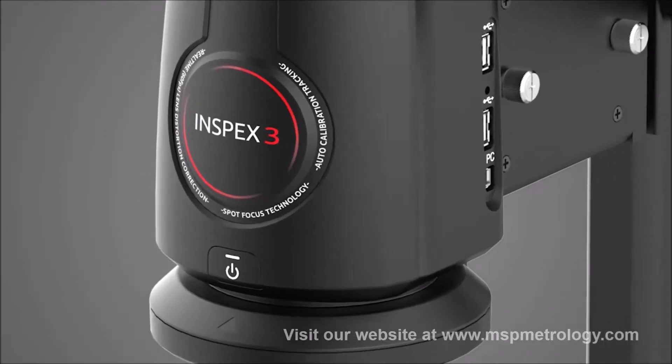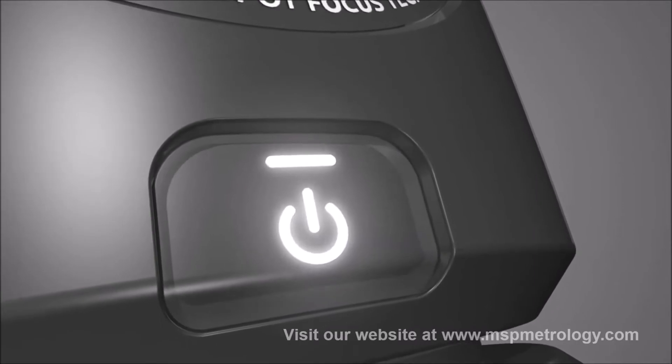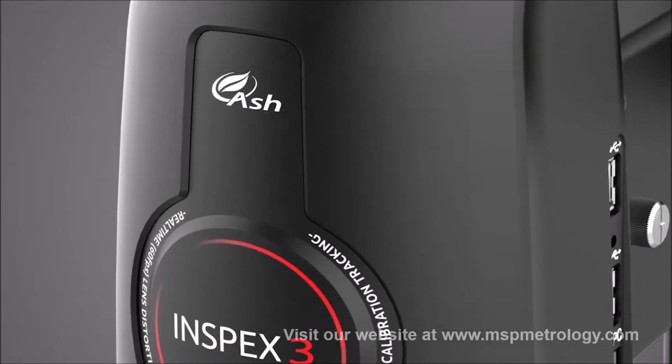Inspex 3 is ideal for industries such as medical device manufacturing, pharma, precision engineering and electronics.